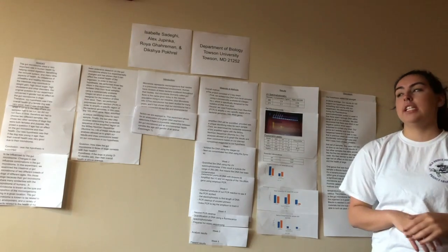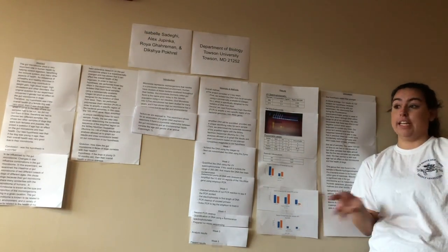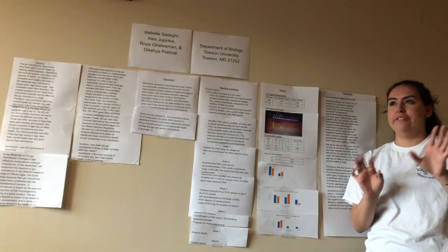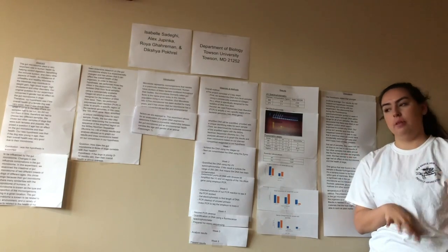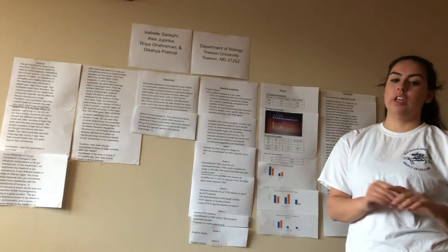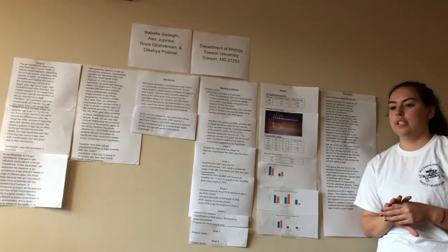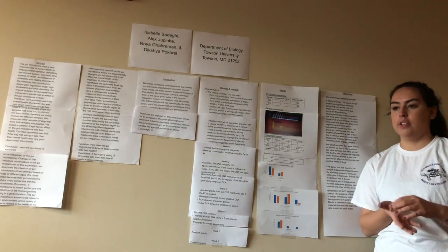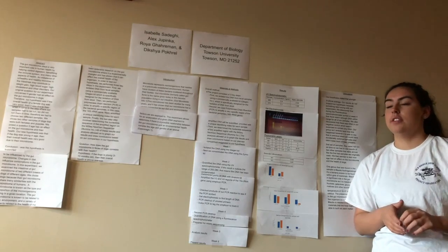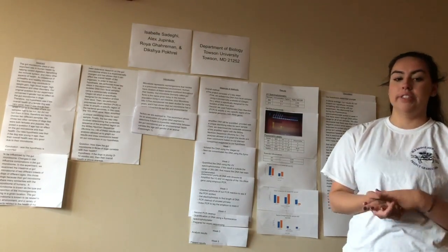We also found that there was DNA in our negative control, which was not supposed to have any DNA because we never put any in it, but the concentration was about 0.535 and the amount of the buffer was 77. Sorry, so for our reads, we had to choose different samples since they weren't processed in time for us to read our results. So we changed this to samples 307 and 343, which had similar characteristics.